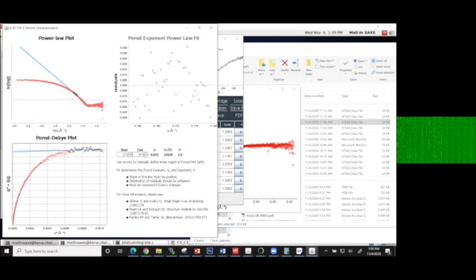Okay, so if you have a well folded system versus a molten globule or an unfolded system, you'll find the exponential decay to be around Q to the negative 4 in a certain region. And once you've found that, it gives you the volume of the protein. That's in cubic angstroms right there. So that's useful to write down.